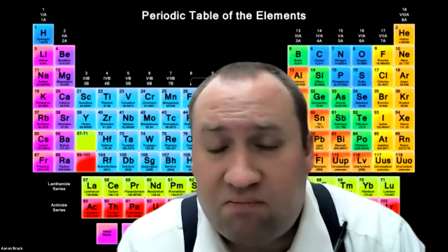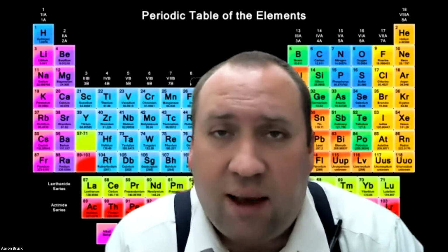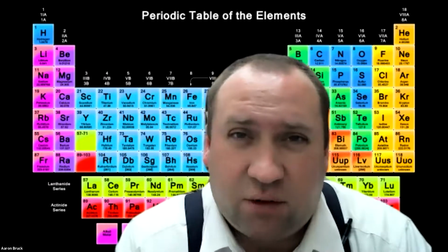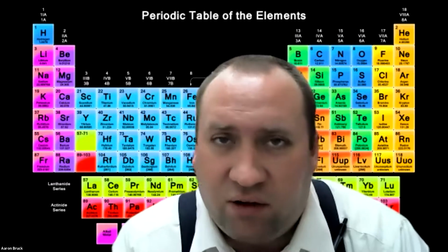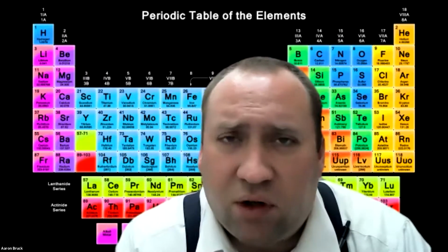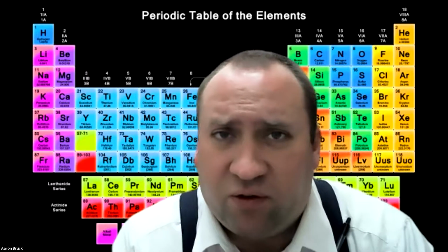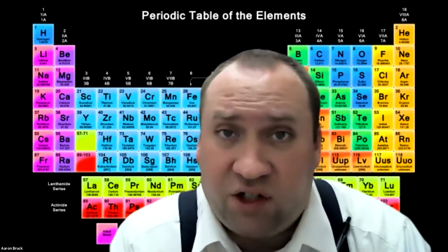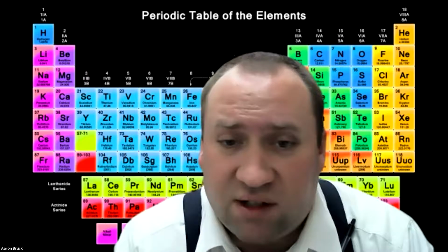Now, this lab is different in very many ways from other labs that we've done this semester. Most of the labs that we've done this semester have been of a quantitative nature, where we've been measuring things in terms of numbers and changes in concentration, pH values, those kinds of things. This is different. This is going to be purely qualitative, meaning we're going to be looking at observations, looking at observable events, and trying to rationalize and make predictions and conclusions off of those observations.